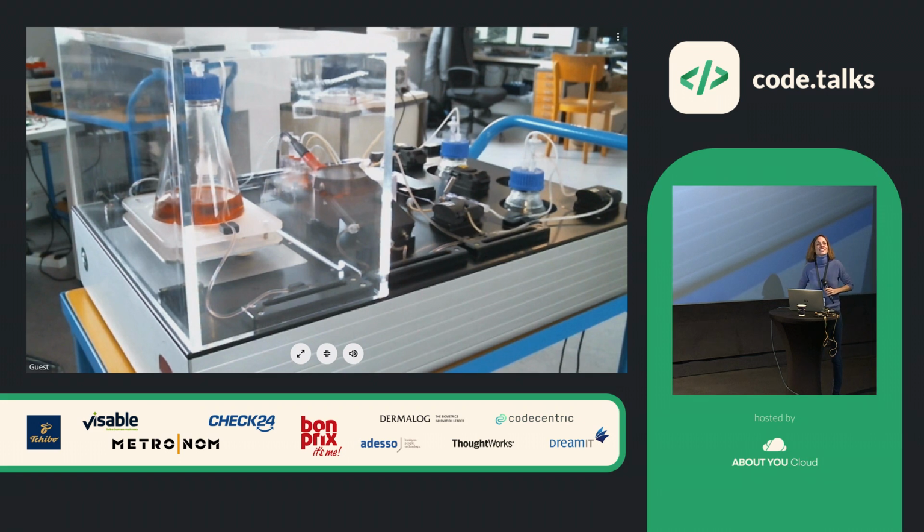How would you handle downtimes in the machine? So if the program gets interrupted at some point accidentally or it overloads? So the most critical thing here is that you lose internet connection. This is the most critical thing that can happen, because of course our customers are super scared that their data gets lost.